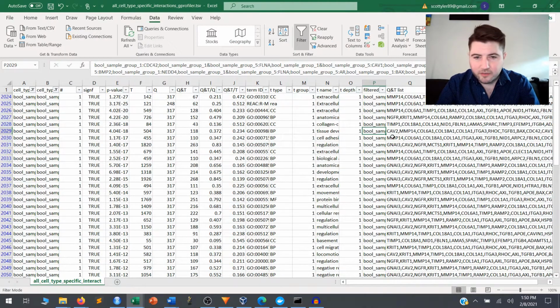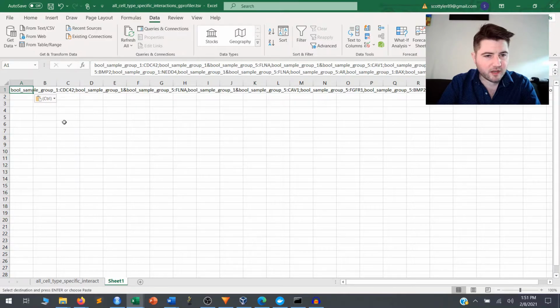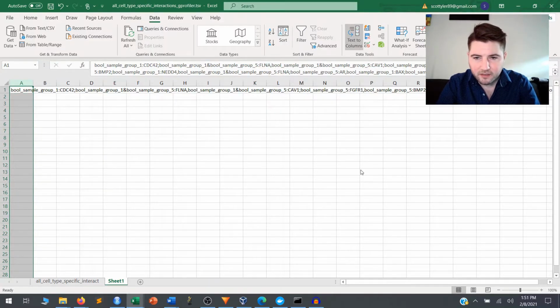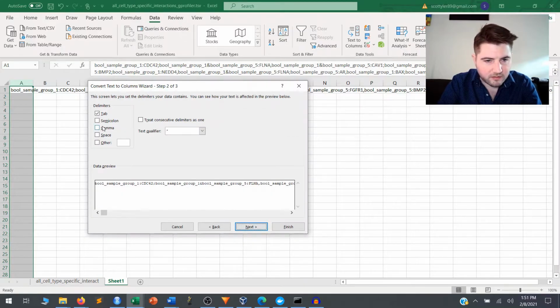And to look at it in a little bit more detail, this column is actually fairly useful. So we can open up a new tab and then transpose that. That didn't work. Right. We have to first separate it based on the first level, which is a comma.